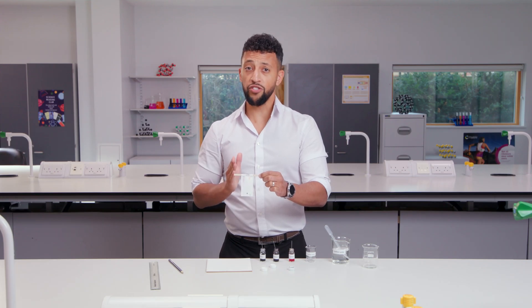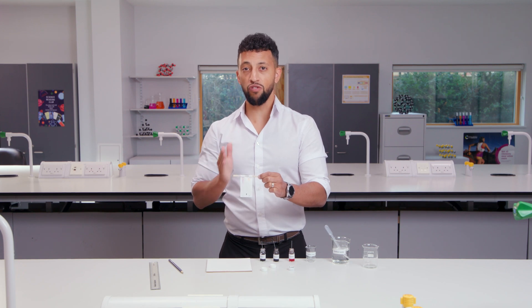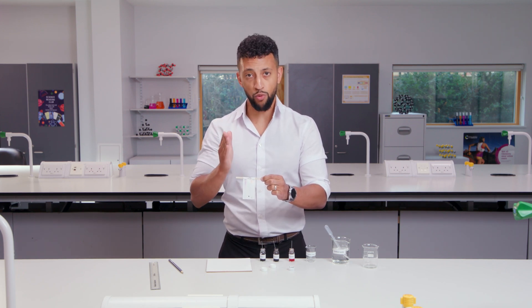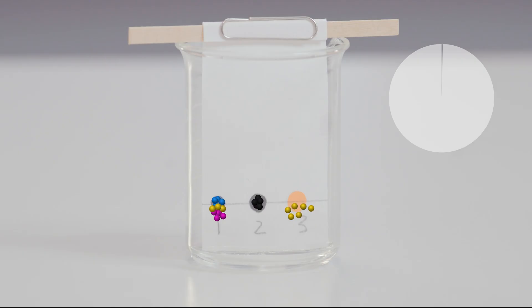The different substances that make up the inks separated and travelled different distances on the paper due to how soluble they are in water. Their movement depends on whether they have a stronger attraction for the mobile phase or the stationary phase. The sample two black ink has the strongest attraction for the stationary phase because it's the slowest to move up the paper.